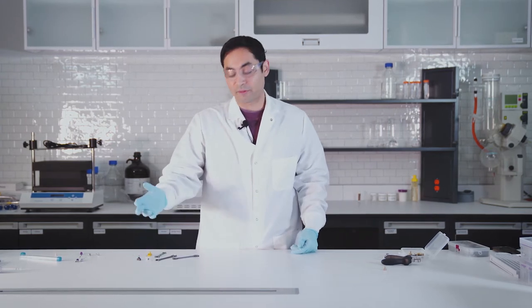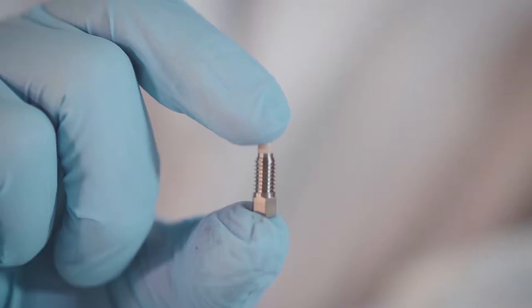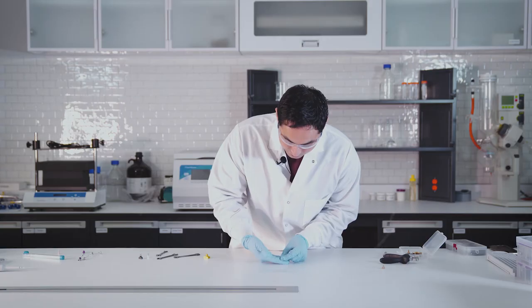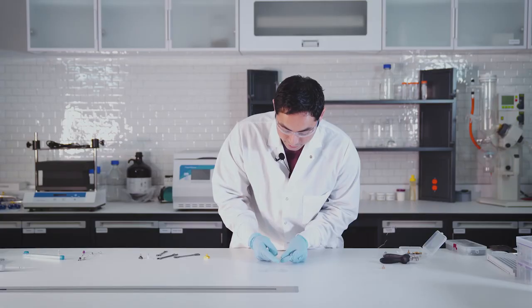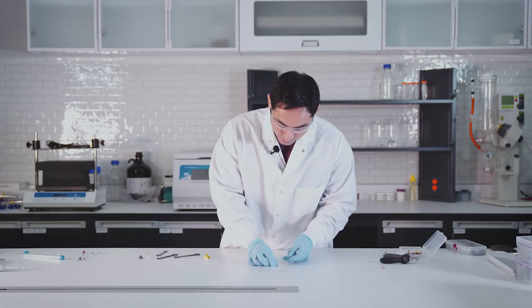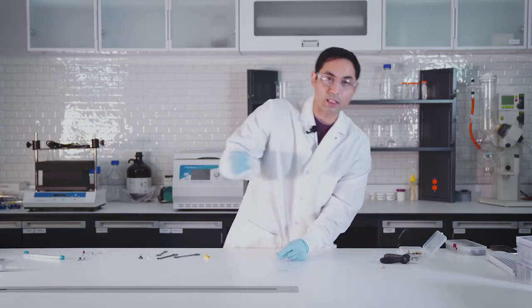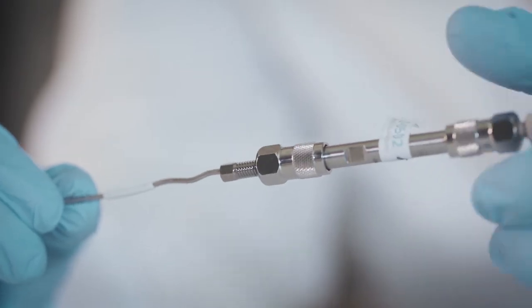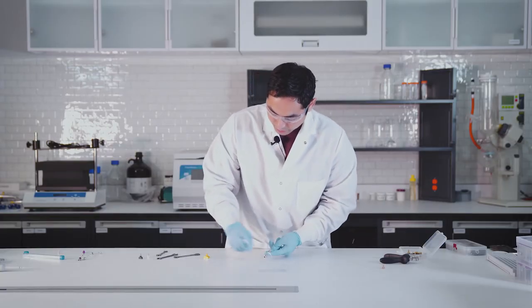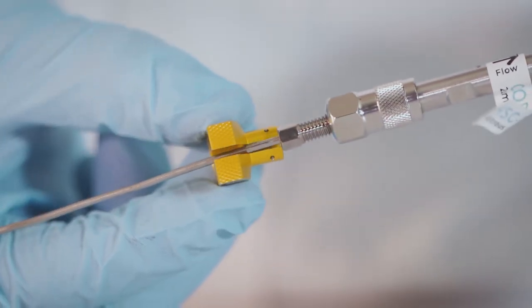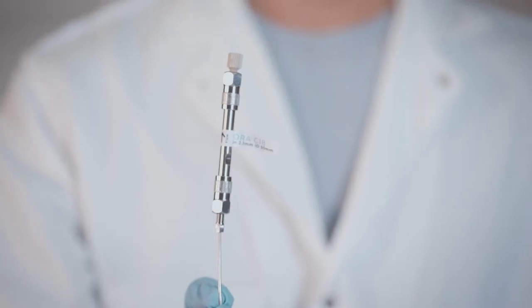But in recent years we've definitely seen improvements and there's finger tight fittings now that are great for UH PLC. So here's one I think it's by Optimize. What's nice about this one is this is a UH PLC fitting but it has that peak head, so this is reusable. You can take this on and off and it's one piece. The way that this works is this goes through the tubing and then you have your column or your port, you insert that in. I would consider this to be semi finger tight because you still need this tool. This goes over like that and then you can just tighten through and that's nice and snug and that works really well.